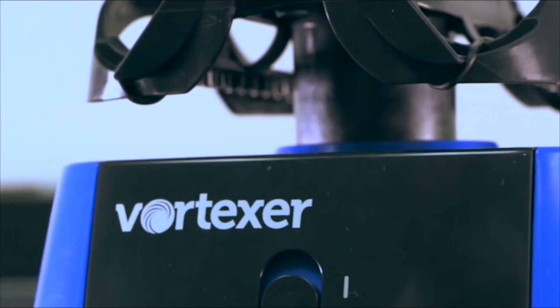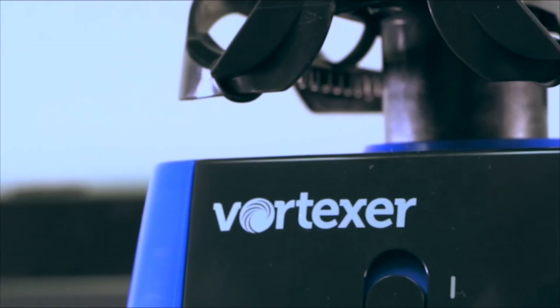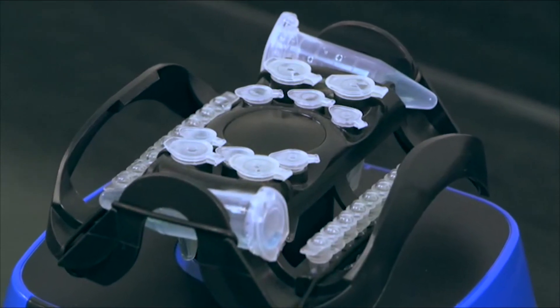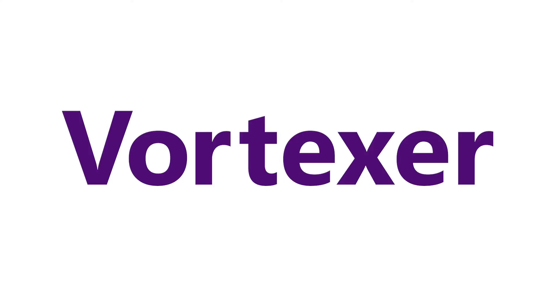There's no need to purchase another mixer — the Vortexer does it all. The flexibility of this unit saves time in the lab by responding to your needs with great versatility. Get yours today.